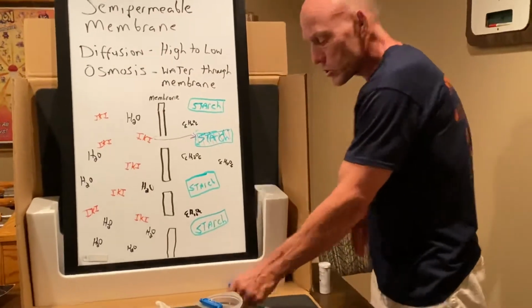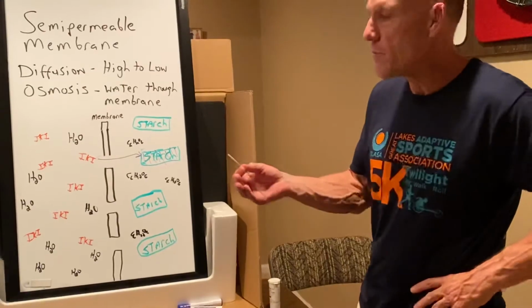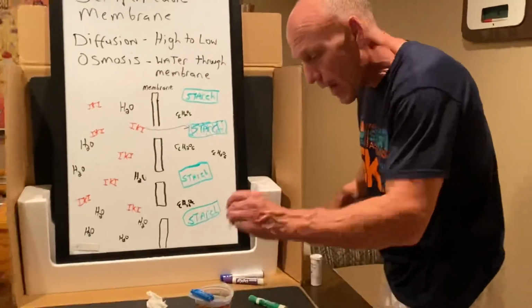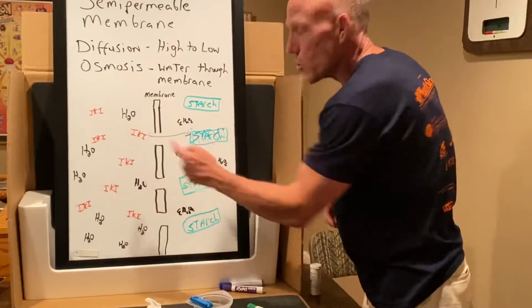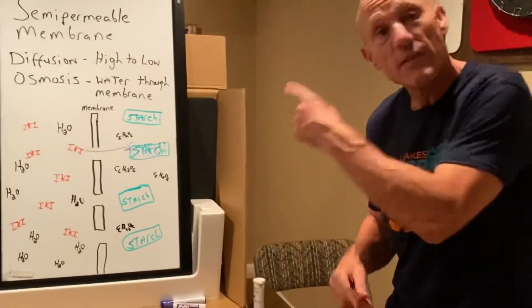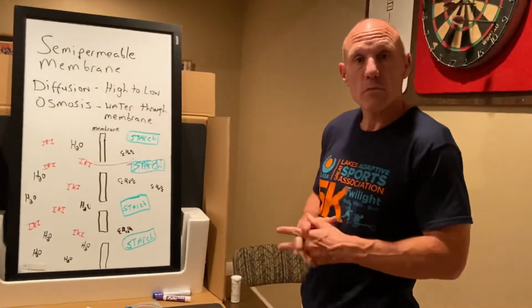Well, for the glucose, I'm going to use this test strip. Similar to what you'd have if you have testing for diabetes in your urine, you'd see sugar in the content. When I put this outside this beaker, we should see glucose getting out if it was permeable to this membrane. Or in other words, are the holes in the dialysis tubing big enough to let the glucose out?